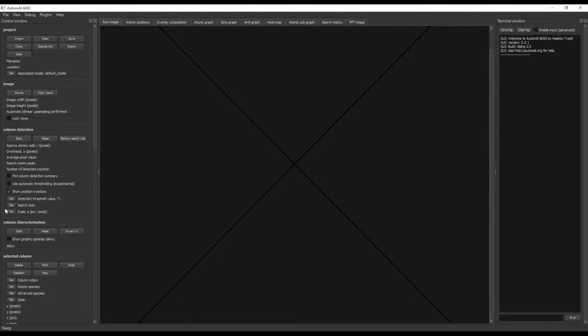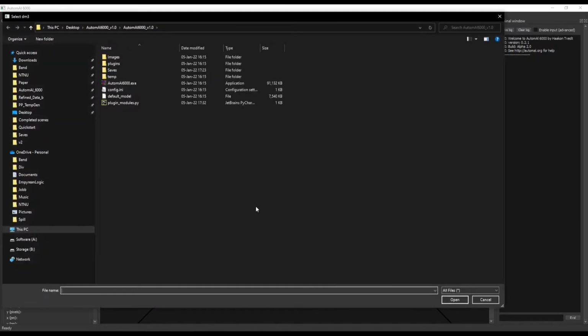What is important that you do first is that the image has been noise filtered, which means that, let's say you get a DM3 image from the microscope, you first have to open it in some digital micrography suite or something, and then you have to do the FFT and then an appropriate low pass filter, and then inverse FFT again, and then save that result as a DM3 file. Once you have done that, you can go ahead and import it here, which I will do.